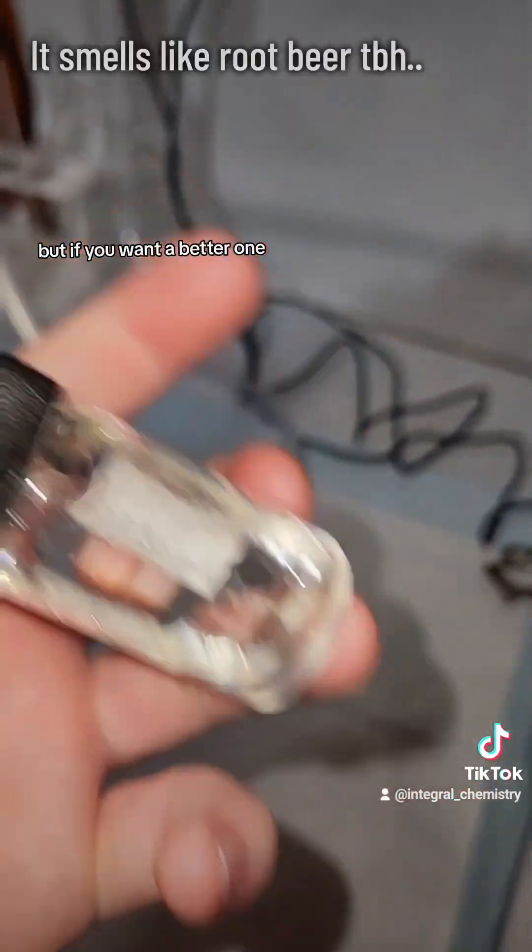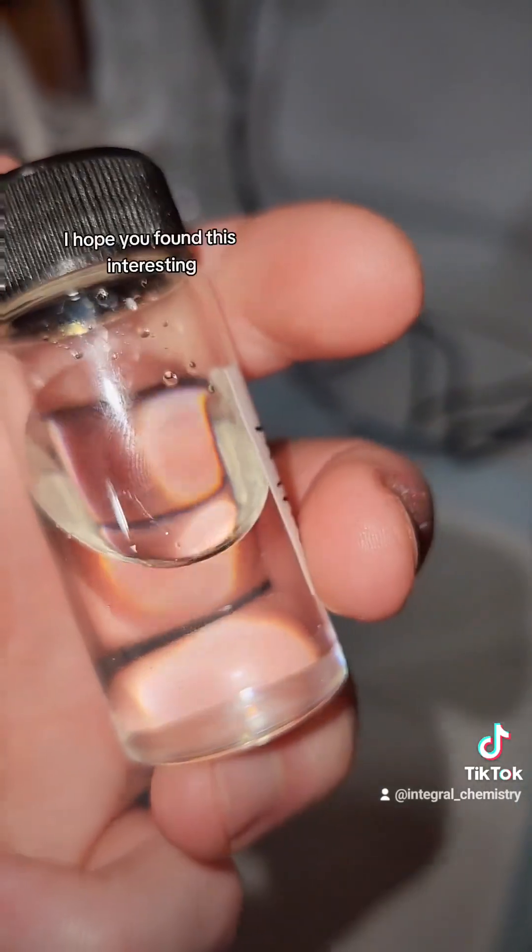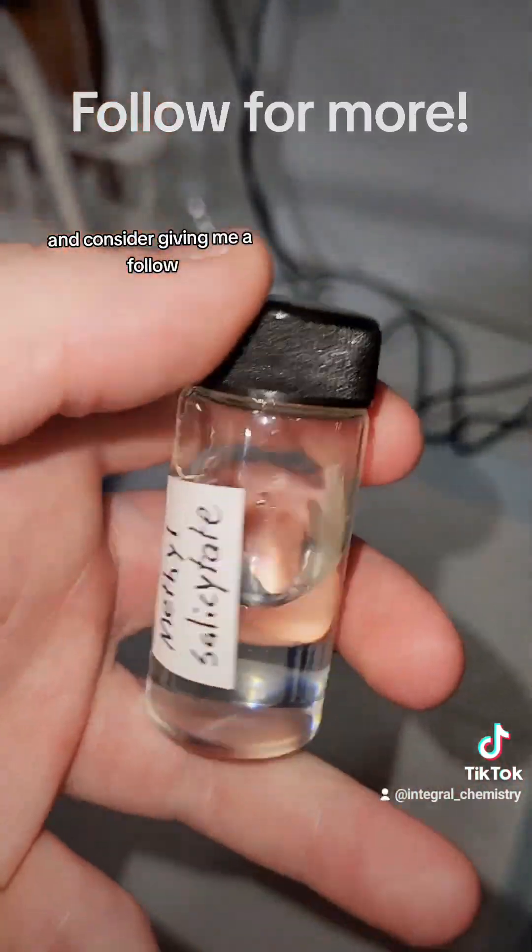This yield is fine for me, but if you want a better one, I'd consider refluxing a lot longer. I hope you found this interesting, and consider giving me a follow.